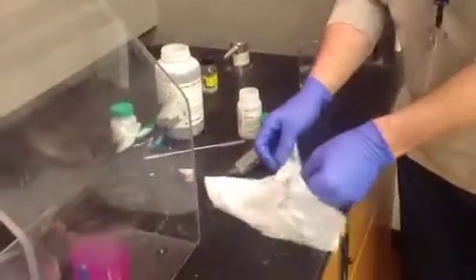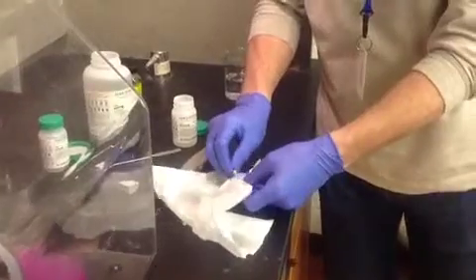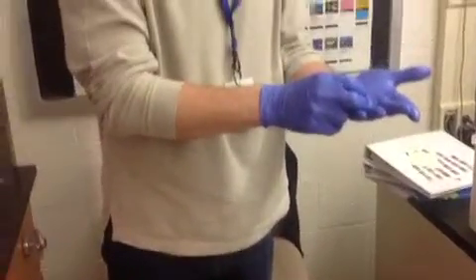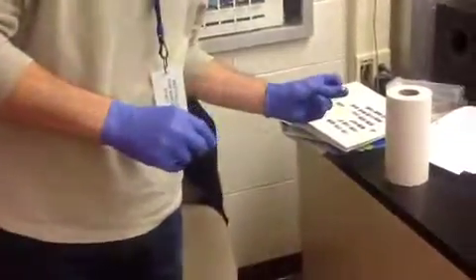Potassium is so reactive that they only sell it to us in these little pieces now. When I was your age, they sold it to us in big chunks. But they sell it to us in these little bitty pieces now. This is the biggest piece of potassium that we can get. It's squishy. It's soft like warm butter. It cuts open extremely easily. And again, we cut it open and there's this nice shiny piece inside. Nice shininess.